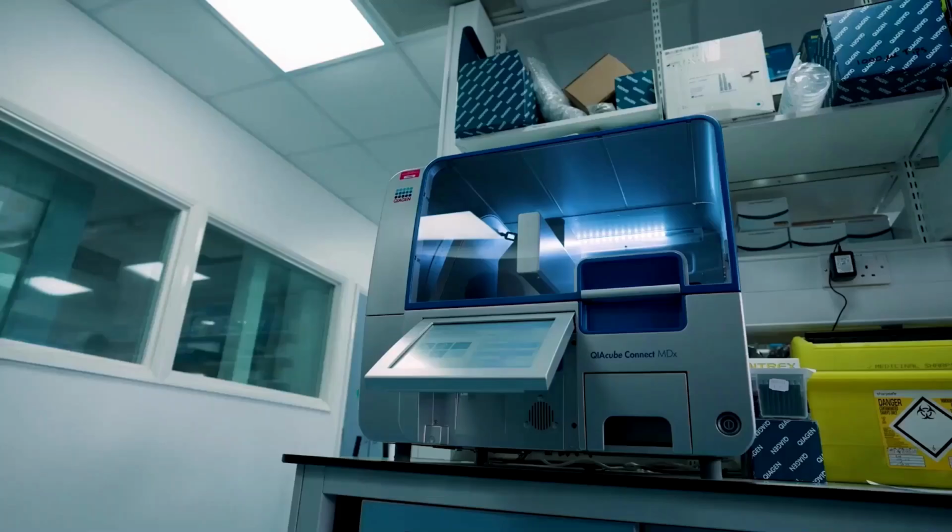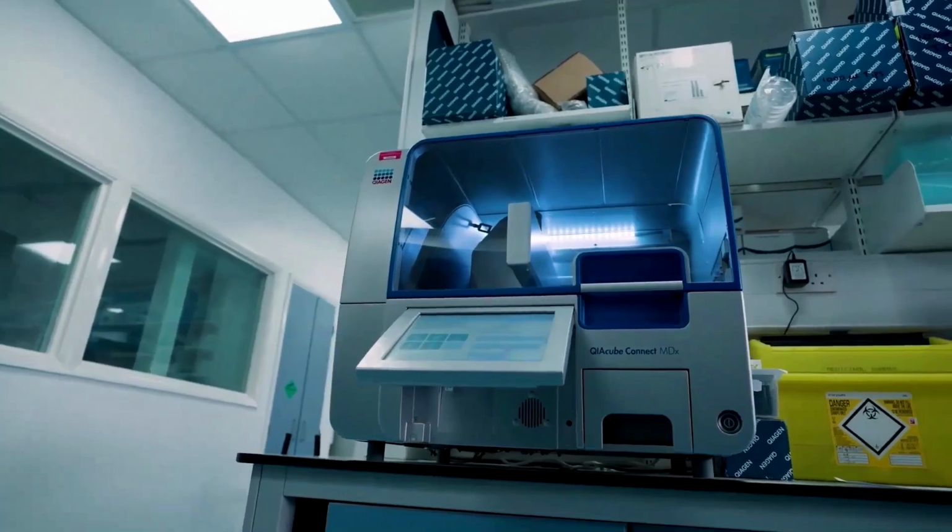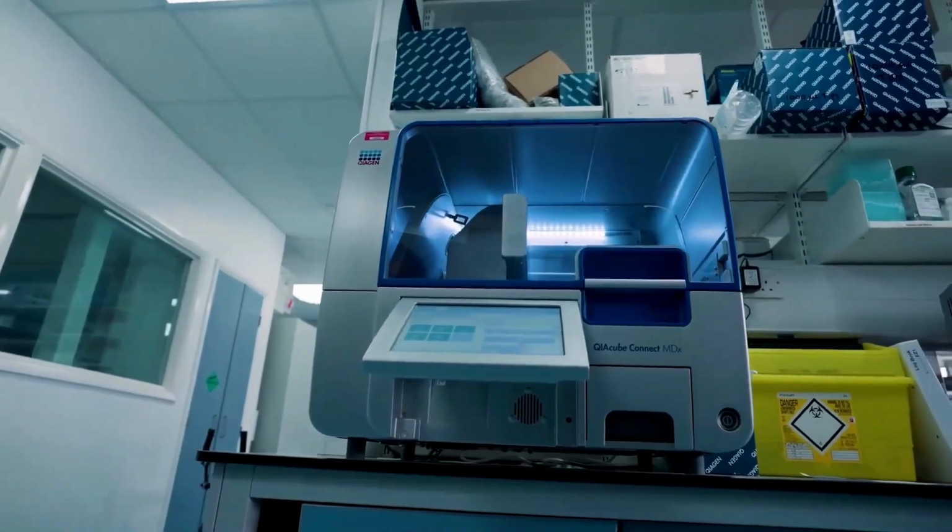The other part of the chemistry that we like is the minimal number of bead cleanups that are required in the library prep. Instead of having bead cleanups, it's enzymatically treated at every stage in the library prep, which means that the number of starting molecules within there stays the same. So the complexity of your library should, in theory, be better. And this is important in applications where you've got very few template starting molecules, such as in MRD monitoring.